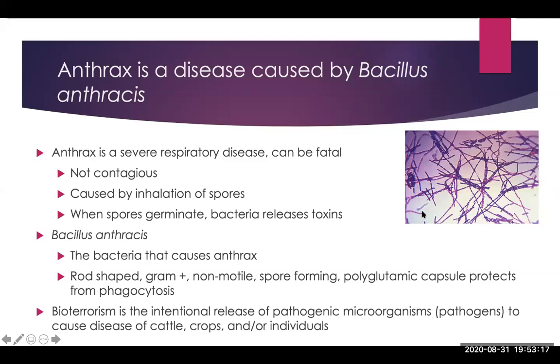And actually, it looks like this little corner here has pink, which just means they started to over decolorize this stain, which is very easy to do. And so whenever you are looking at bacteria under the microscope, you don't pick out the couple of examples that are different. You look at the majority, and if the majority are this dark purple, then it's gram positive. If the majority were the hot pink color, then it would be gram negative.